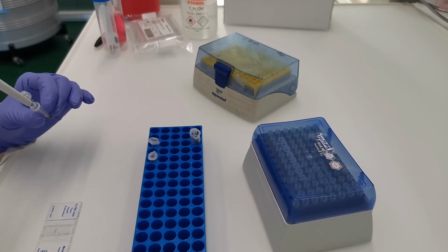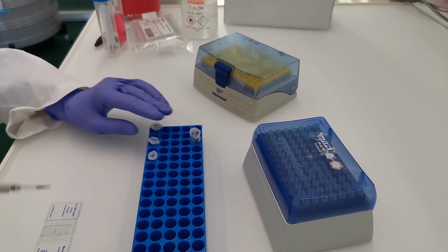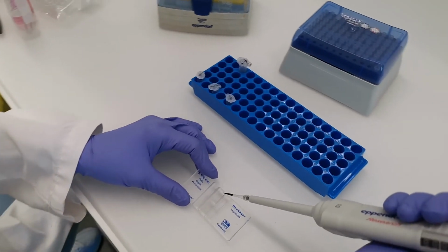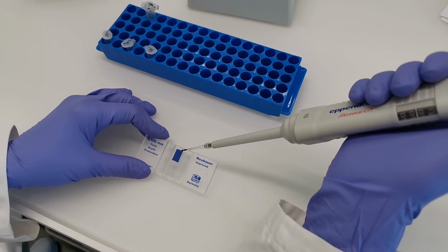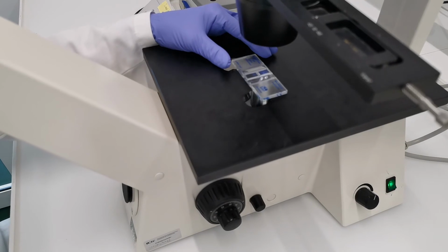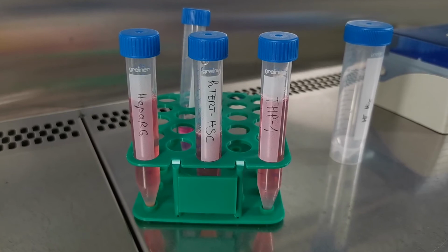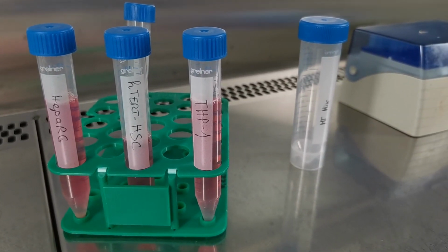Trypan blue is added at an equal volume to the cell suspension, so in our case, 20 microliters. 10 microliters of the mixture is then loaded into the Neubauer chamber to allow counting of total viable cells. The Neubauer chamber remains the most common method used for manually counting cells. Counting of viable cells is performed under a light microscope following the procedure of the Neubauer chamber. All 3 cell suspensions are counted and the desired cell numbers are calculated.